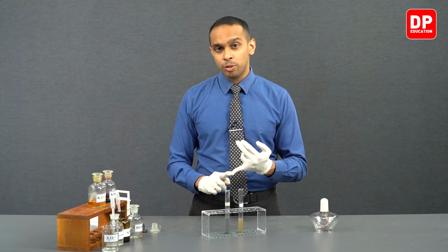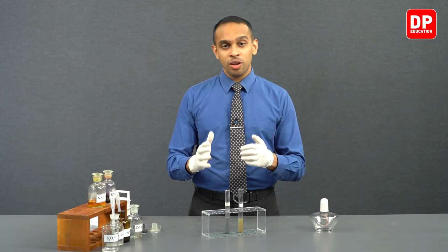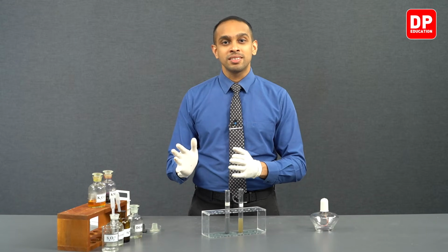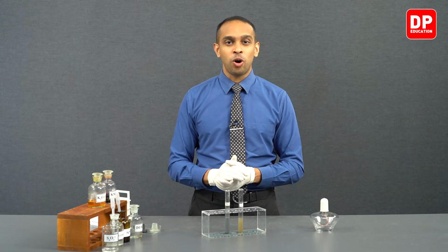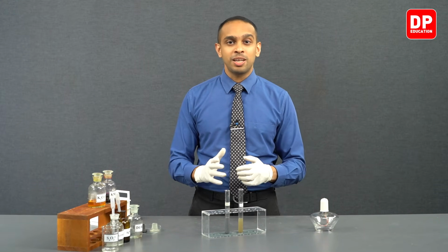When silver ions come into contact with our thiosulfate solution, we observed it forms a white color silver thiosulfate precipitate, which is an unstable precipitate, so it readily undergoes decomposition to form silver sulfide, which is a black color precipitate. And then we reacted our thiosulfate ions with lead 2 plus ions to form lead thiosulfate. Lead thiosulfate is a white color precipitate.